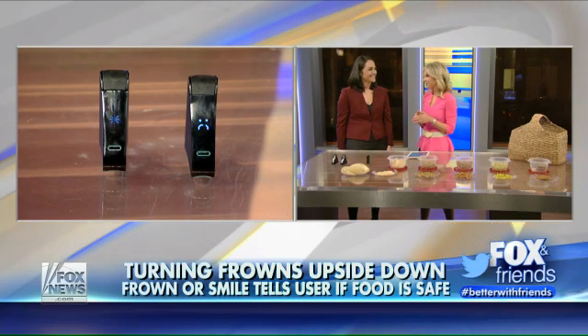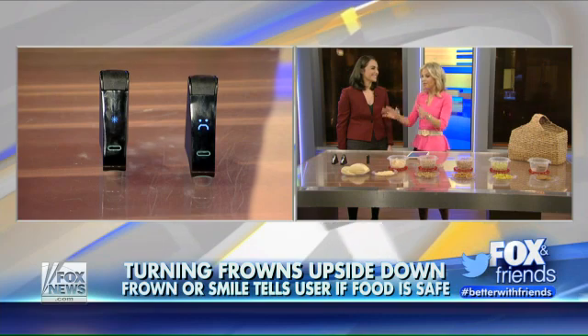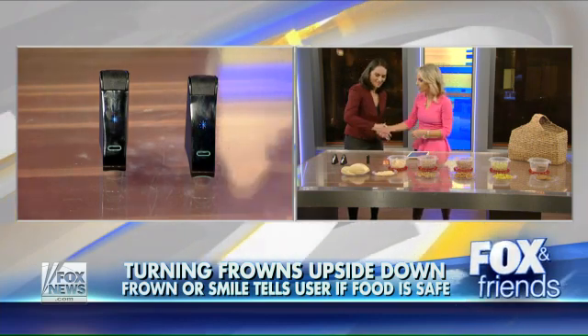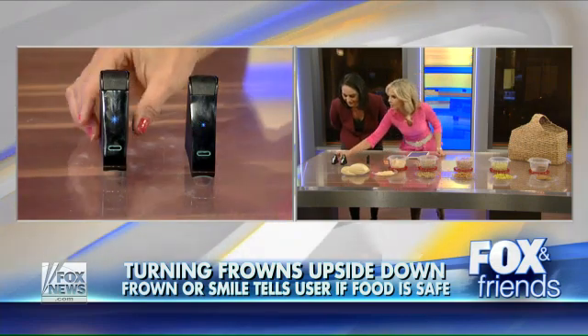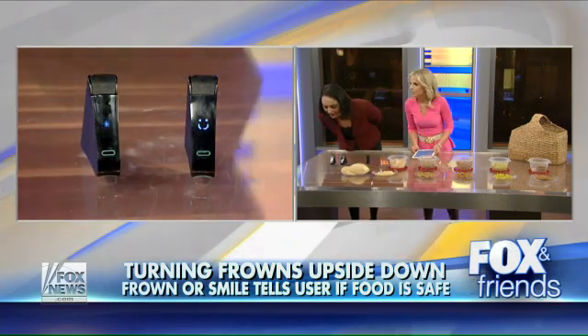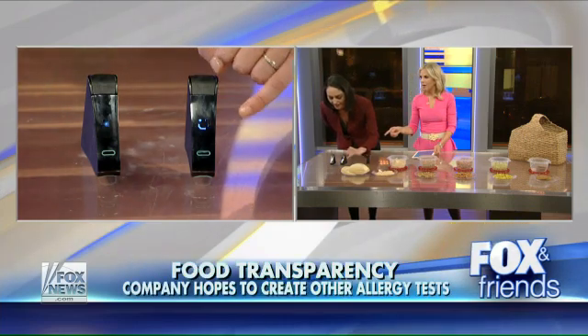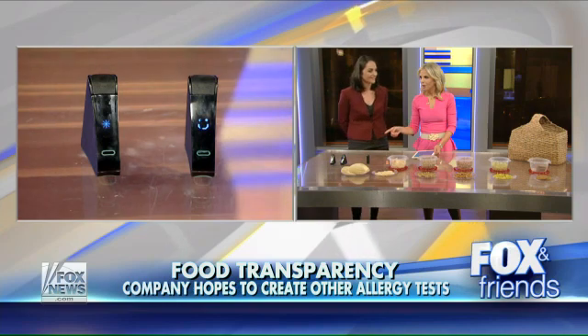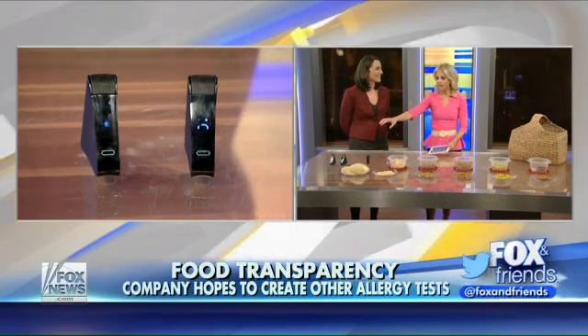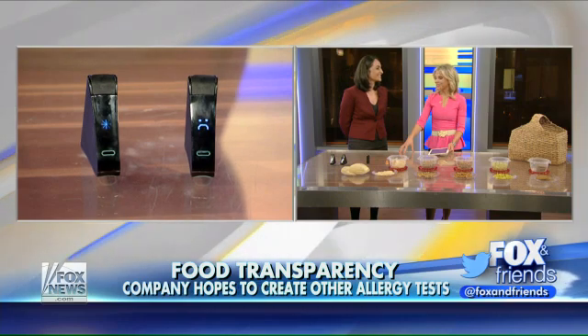You make a big difference when you're out and about — you just want the freedom to know that your kids and you are absolutely safe when it comes to food. Thank you so much. And if you get a smiley face or a frown on this first test, what came through here? It's still running. So you can see the two smiley faces here and then a sad face here, and then this one's still going. We've got one gluten-free result. I'll post the results on our Fox and Friends page as well. Thank you so much.